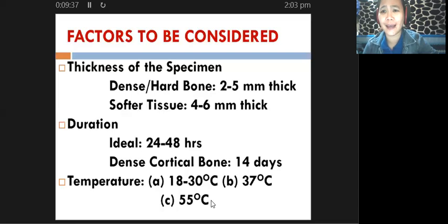So we have to be very careful because it will enhance the injurious effect of your acids in your tissues. So there will be complete digestion of your tissue sample. Pagbalik mo, nawala ka lang saglit, isang araw lang. Pagbalik mo, wala na siya.